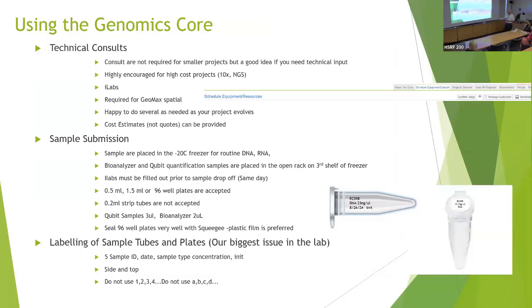So a couple of things I want to go over for the lab. A lot of people come to us with the same issues. So we have technical consults, and we really encourage those, as I just explained. They're required for things like genomics studies and 10x studies. We're going to require you to sit down with us because these are really expensive. But if you're just wondering about some project that you're not sure about, even if it's just troubleshooting PCR, you're welcome to send us a note. We're happy to help you go through PCR and help you design and figure out primers, but it's not required. It's just something we want to help you with.